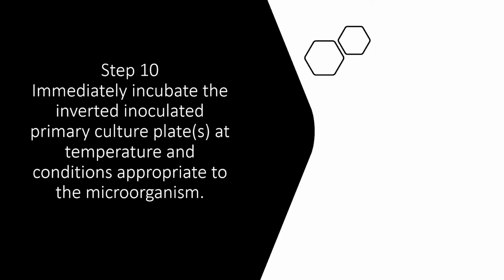Once you get to the stage of plating out the microorganism, you should incubate that. Normally it's incubated inverted, at the correct temperature and conditions. How do you know what those correct temperature and conditions are?